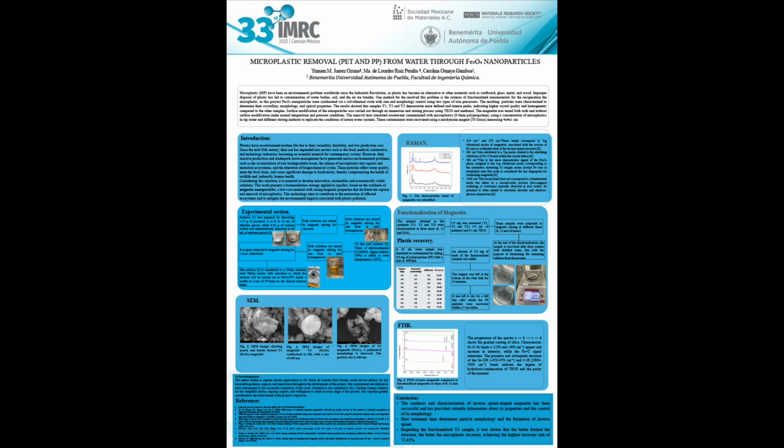The removal test simulated wastewater contaminated with microplastics, 0.4 mm polypropylene, using a concentration of microplastics in tap water and different stirring methods to replicate the conditions of natural water currents. These contaminants were recovered using a neodymium magnet, 50 Gauss, measuring 4 by 4.